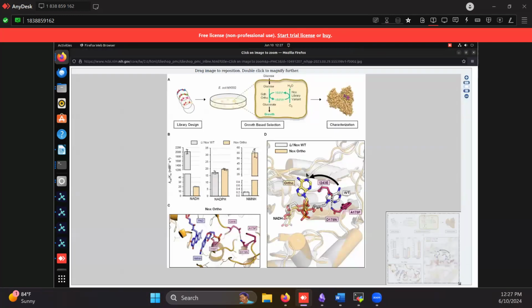For the image C here, there is a big contrast between the background proteins. They've used a very similar scroll-based selection to remove a lot of the cartoon representation. They're using that same depth cue fogging that we are. The ligand itself is very dark blue, and the background is orange. So it shows the ligand in very high contrast to the background, so we can see very clearly where the bonds are and which ligand is placed where.